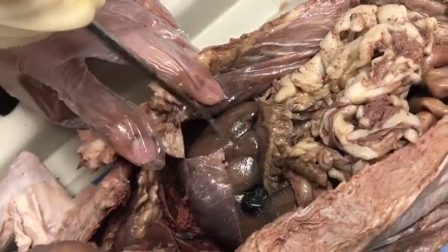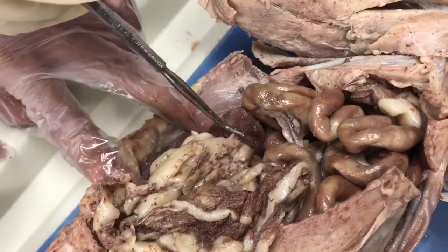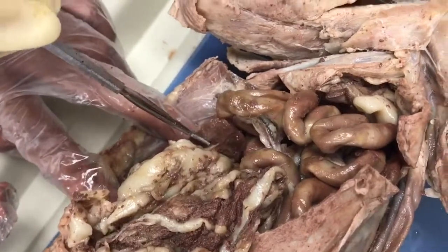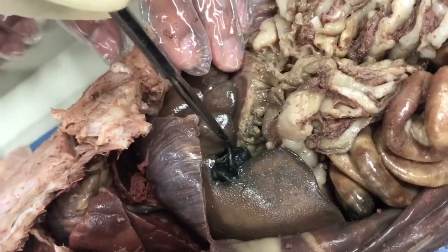Okay, so this is the liver. It's anterior to the stomach, and its function is to produce bile. So this is the pancreas. It's posterior to the omentum, and its function is to produce digestive enzymes in order to break down food. This is the gallbladder. It is inferior to the liver, and its function is to store bile.